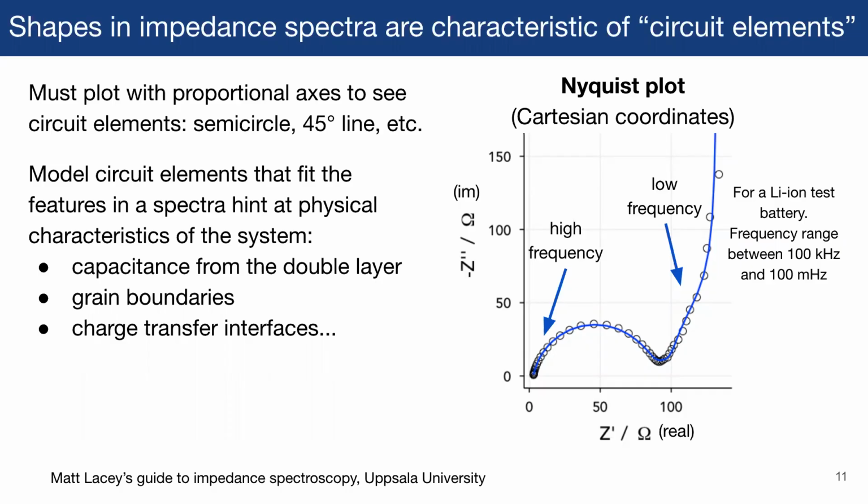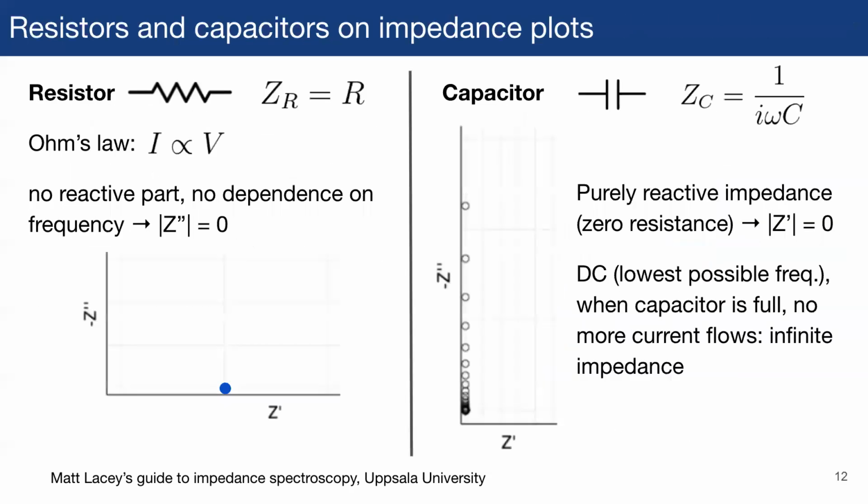Now, these fits are not trivial, and so it requires a lot of thought and a lot of justification as to why you're building these fits in this way. So let's start looking through some circuit elements. The first element that we can have is a resistor.